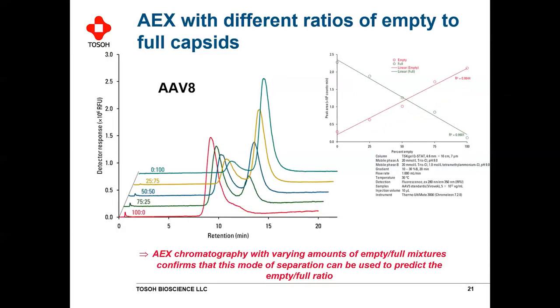We repeated this experiment with AAV8, and we got, again, very nice linear responses for both empty and full.